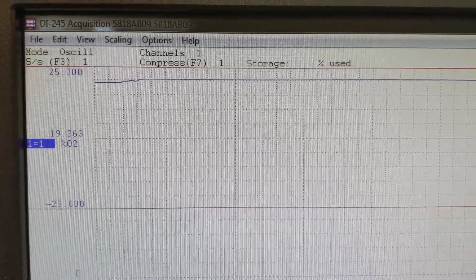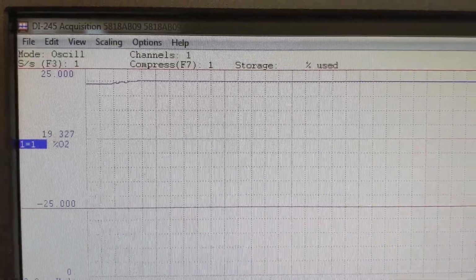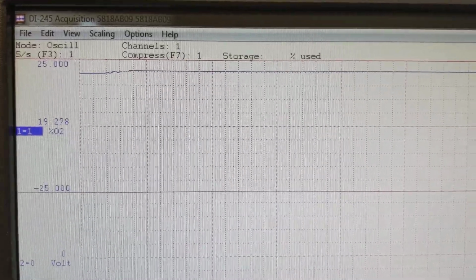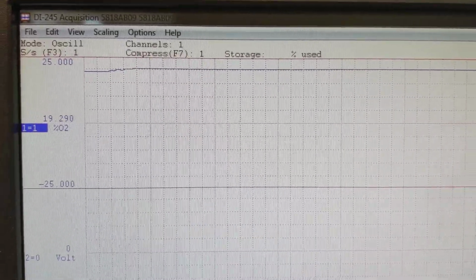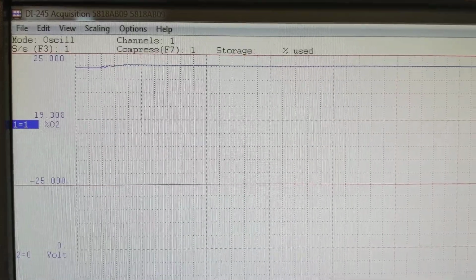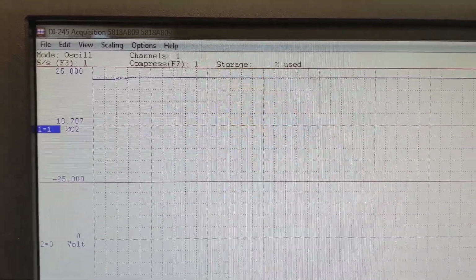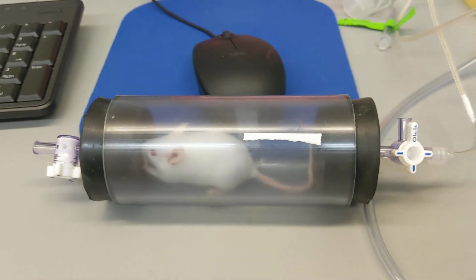What I'll do for you is collect a series of data samples using mice acclimated to these chambers during a set period of time, and we'll compare the values that we're getting from these to empty chambers and be able to calculate the percentage of oxygen that these organisms are using during a timed trial. And that is our flow-through respirometry chamber.